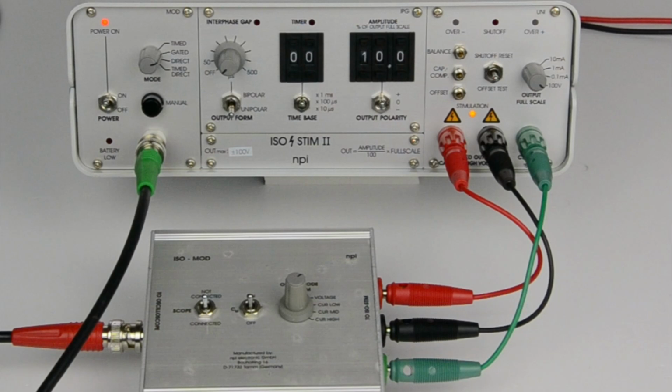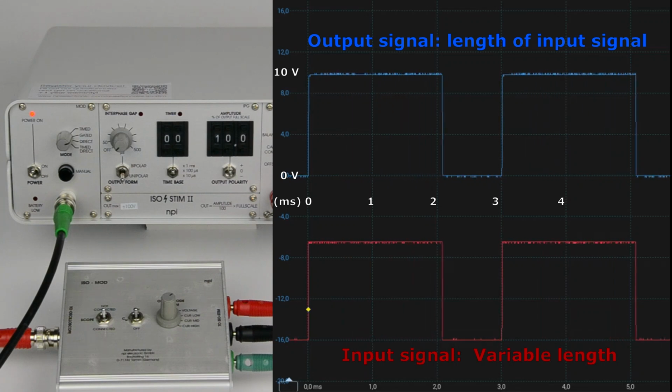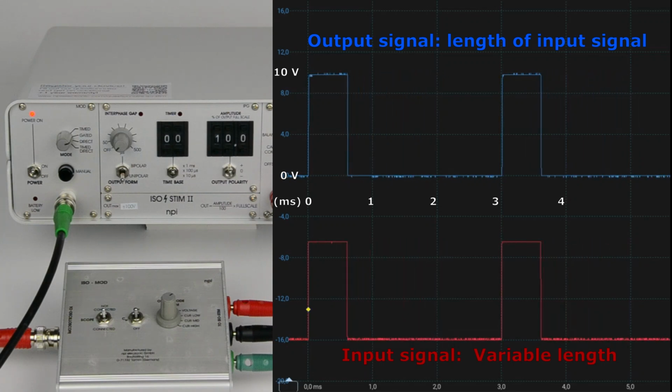To demonstrate this, I change the duration of the incoming TTL pulse. The resulting output pulses have the same duration as the input pulses.